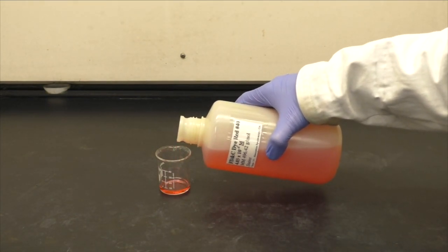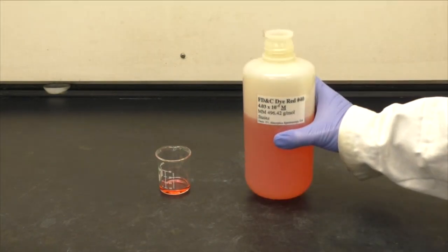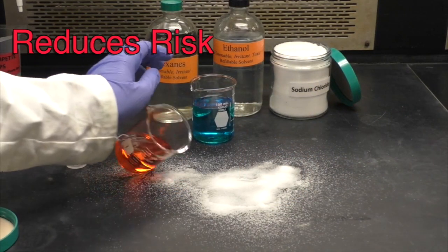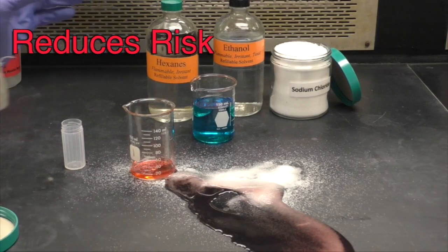Using small amounts of chemicals in a chemistry lab accomplishes three things. It reduces the risk of a chemical injury or spill in the lab.